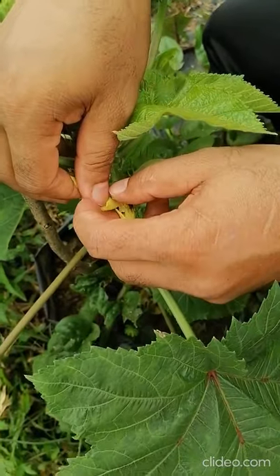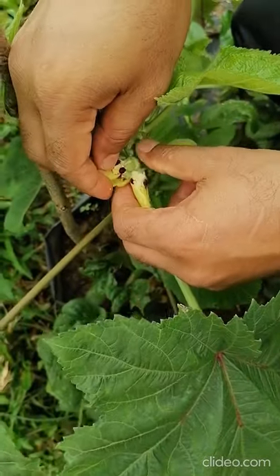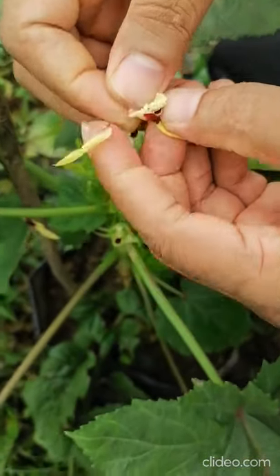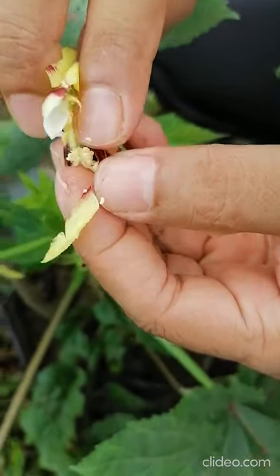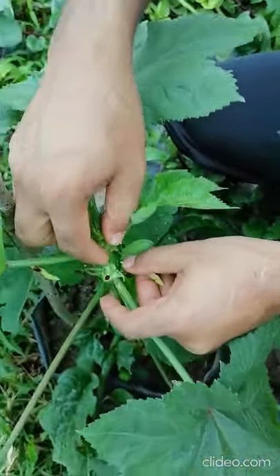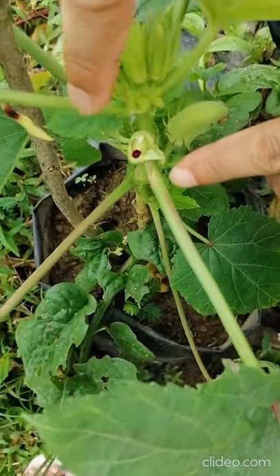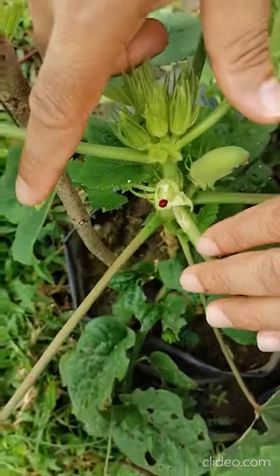This is the red color single stigma. When you remove, you can see the anthers and petals all together easily removing. You can see this is the petals and these are the immature anthers — tomorrow they will be very yellowish color. So you can see this is very nicely emasculated — no anther here, only the red color single stigma with five or six lobes.